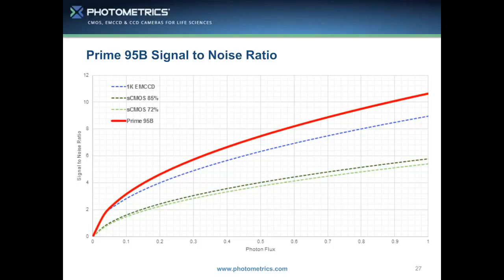Can you explain how this camera is 3 times more sensitive than the current SCMOS technology with only about 12% increase in quantum efficiency? And when you consider the difference in pixel size that you did with the SCMOS versus the EMCCD comparison, what is the true gain? Sorry, that just jumped away from me. What is the true gain? The question just jumped away from me there. Sorry about that. Oh, it's okay.